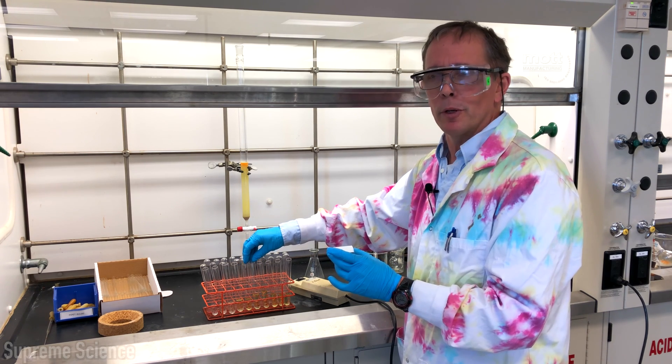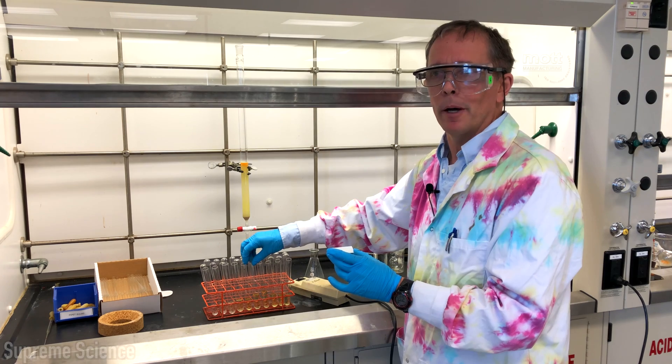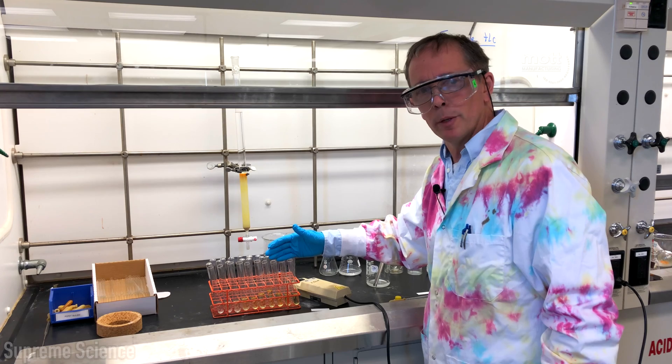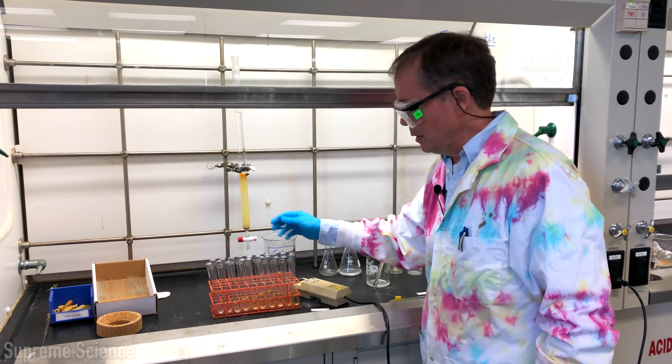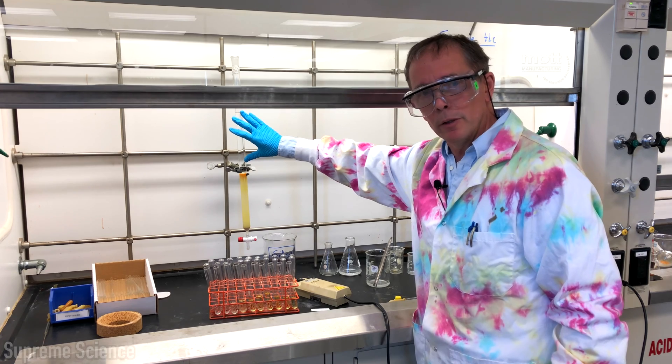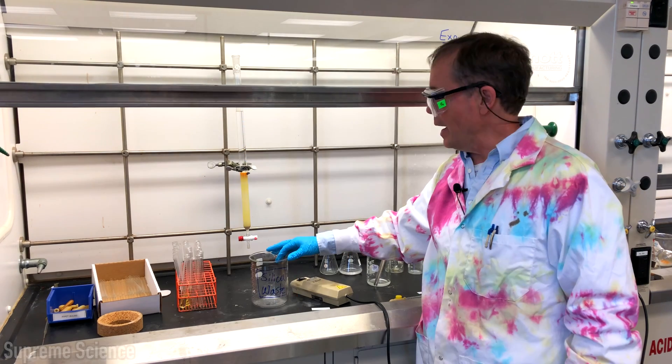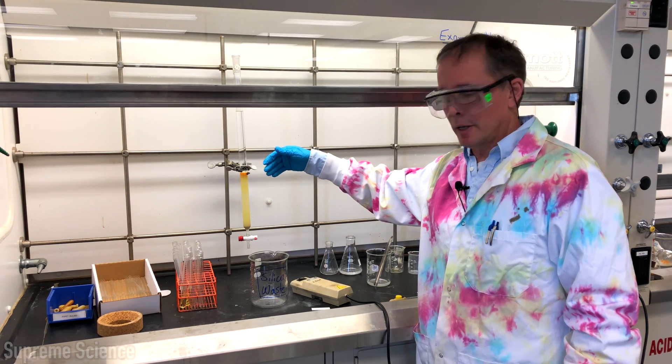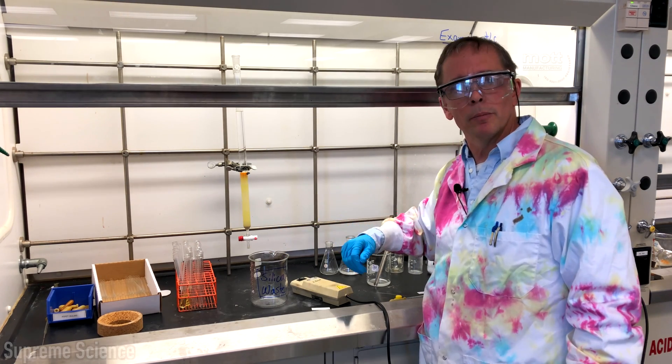Clean up is fairly simple. We'll dispose of the unwanted fractions into the appropriate organic waste solvent bin. We will then tip out the remaining solvent at the top of the column into its appropriate waste. And then we're going to tip the column upside down, open the stopcock, let the silica pour into the waste silica gel beaker.